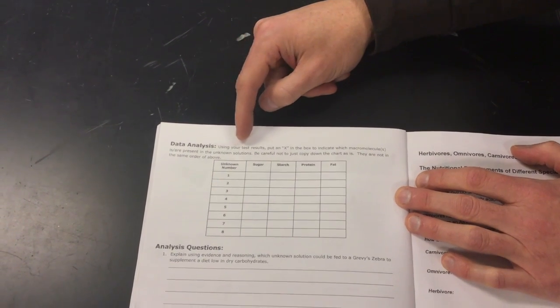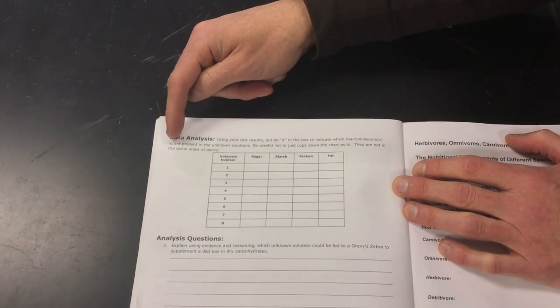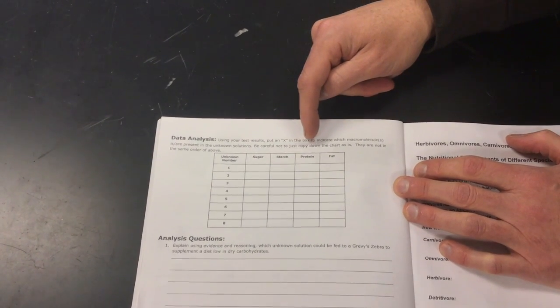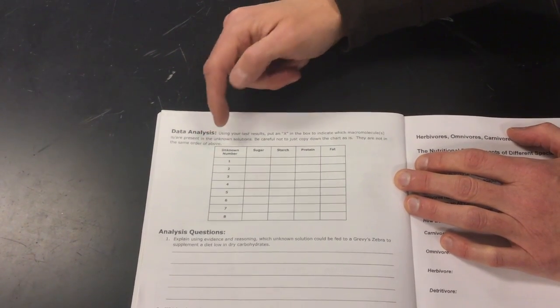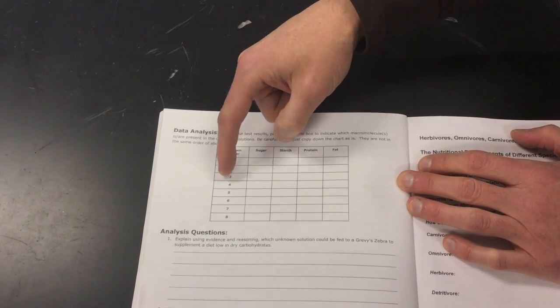And it says, using your test results, put an X in the box to indicate which macromolecules are present in the unknown solutions. Be careful not to just copy down the chart as is. They are not in the same order of the above. So what I want you to notice is we have unknown solutions 1, 2, 3, and 4.